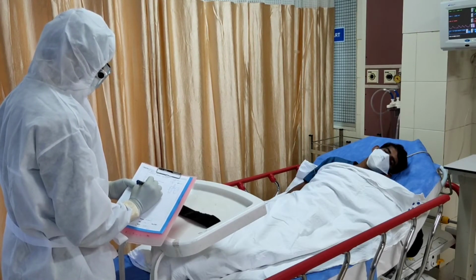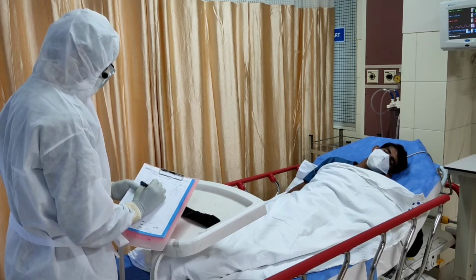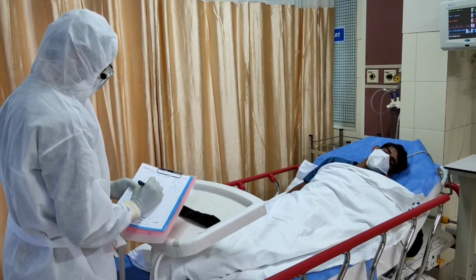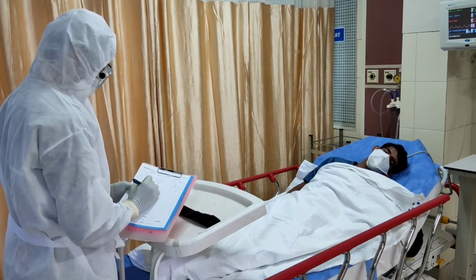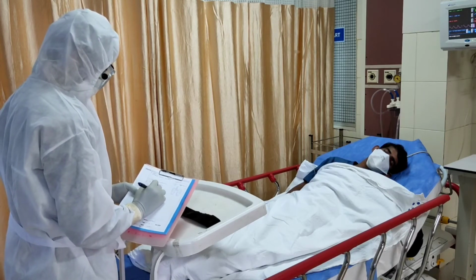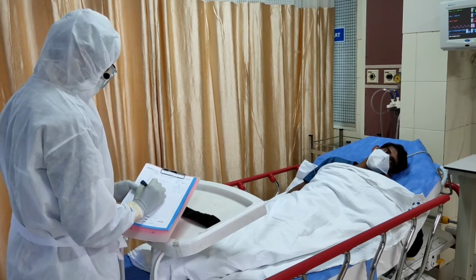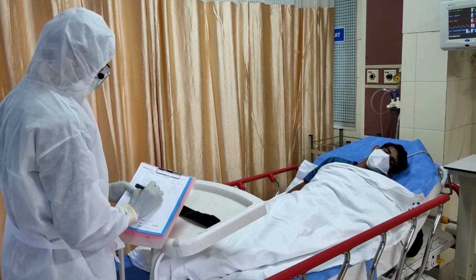I hope you have all watched our previous video regarding how to properly put on a personal protective equipment, or donning of a PPE, in which we have shown you how to put on each part of a personal protective equipment and how to enter into the decontamination unit. Today we are going to present you a video regarding how to properly put off, or doff, a PPE. As you remember, Mr. Stephen has already been inside the decontamination unit after donning the PPE. Let's watch.